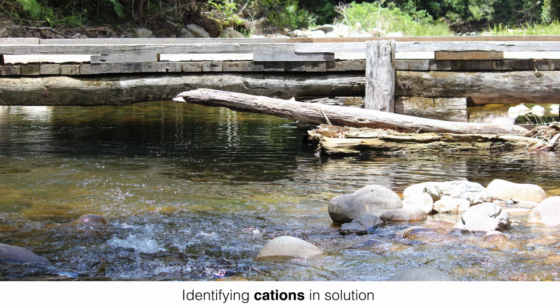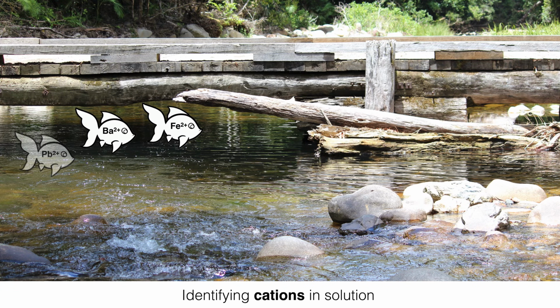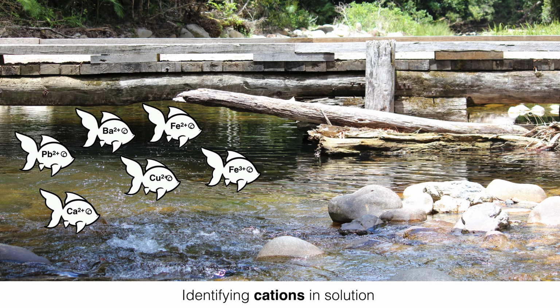You see, water contains all kinds of different dissolved ions in solution, and our task in HSC Chemistry is to see if we can use chemistry to draw those ions out of solution and prove chemically that they are in fact there, although we can't see them with the naked eye. So imagine you've got a body of water, a sample of water. Hidden within that water in HSC chemistry are one of 6 ions. Here they are appearing from the solution before our very eyes.